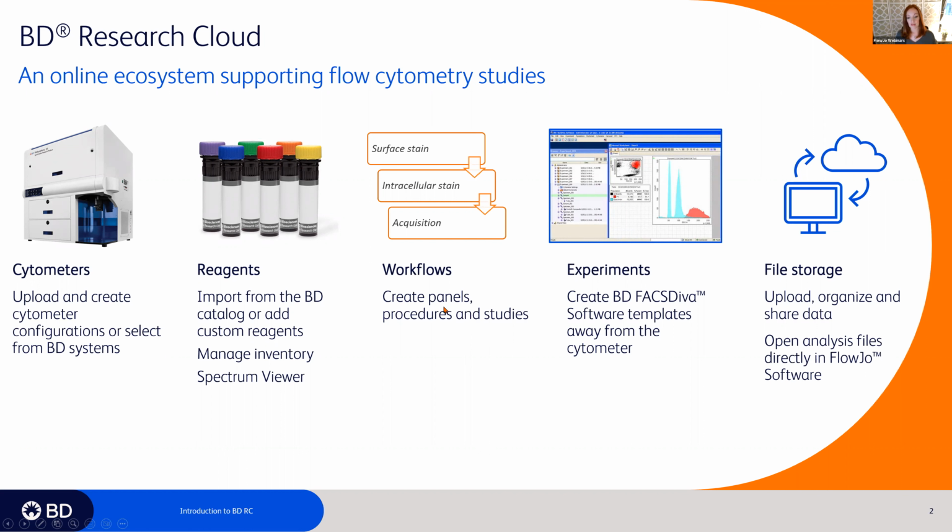And in addition to making panels, you can even make procedures like protocols that you can share with people on the platform, or make them interactive if you have offsite collaborators. And one of my favorite features is the ability to make BD Diva templates away from the cytometer. For those of you familiar with BD instruments for cytometry, you know that Diva is typically the acquisition software.